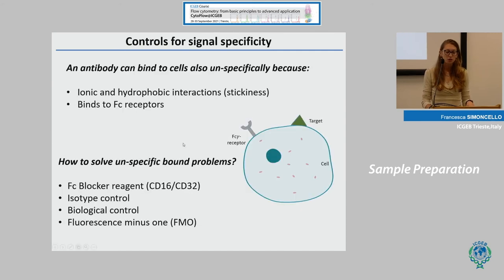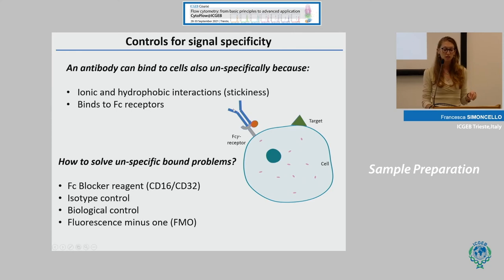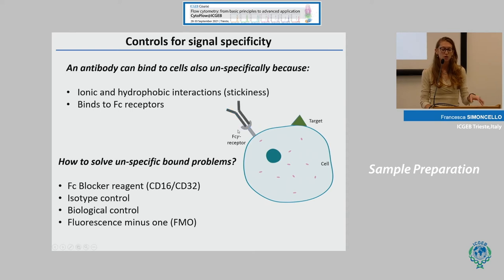An antibody can bind cells non-specifically due to stickiness, and also because your starting sample may contain cells including macrophages that express the Fc receptor. This receptor binds the constant region of the antibody, meaning your specific antibody can interact with the Fc receptor and produce a non-specific signal. To solve this, treat your single cell suspension with an Fc blocker reagent to block the Fc receptor before performing your extracellular staining.